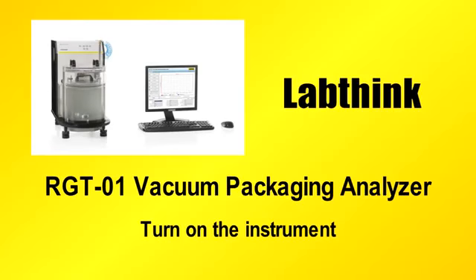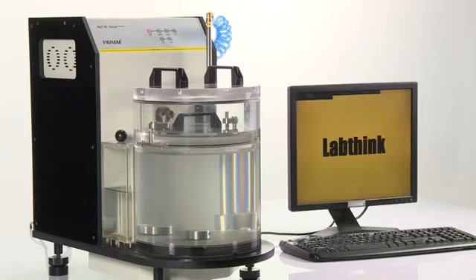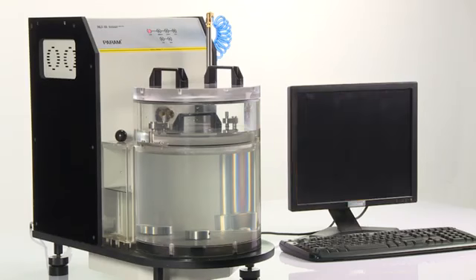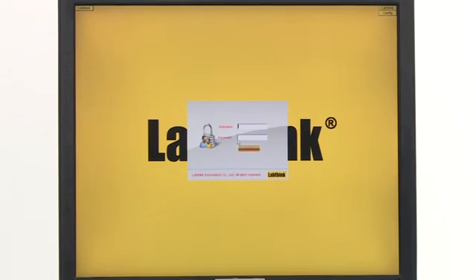Turn on the instrument. Turn on the mainframe. Enter the login interface. Input username, admin, password 123456. Click Login and enter the main interface.